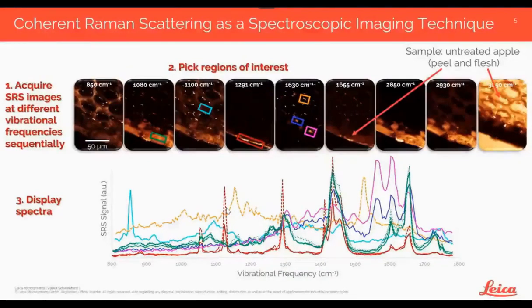I have another two-part question. What dichroic is used in the microscope for the RLD detectors in backward direction? And what is the transmission range? Okay, so that is a very technical question. I want to answer it from an applicative point of view. The question probably comes from organizing the way that signals are transmitted to the sample and separating them from the different frequency CARS signals that are being emitted by the sample.